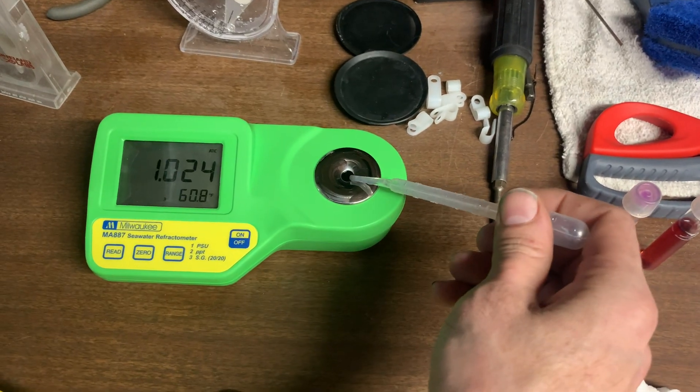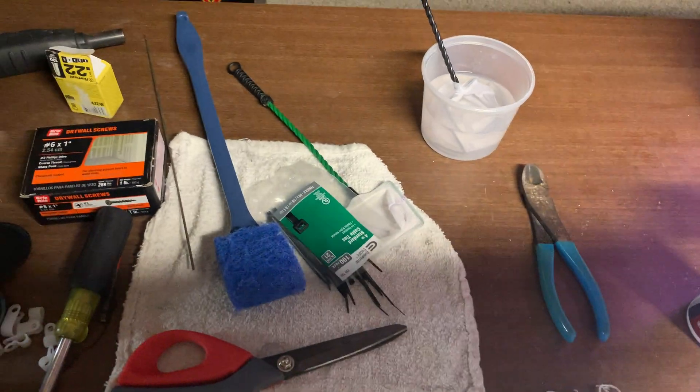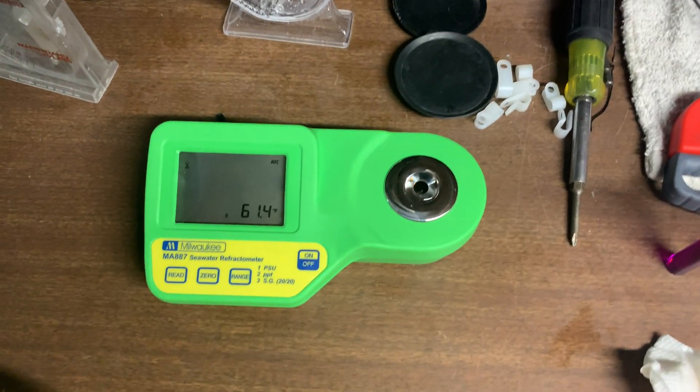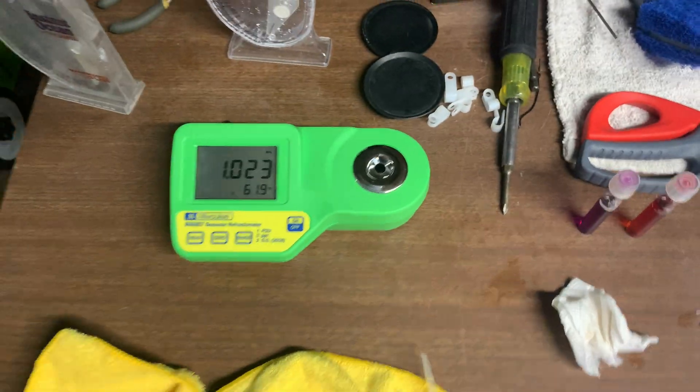Clean — put it here. Fill it up. Fill this up with as much water as you can fit. I like this thing. It works quick. There you go. 1.023.